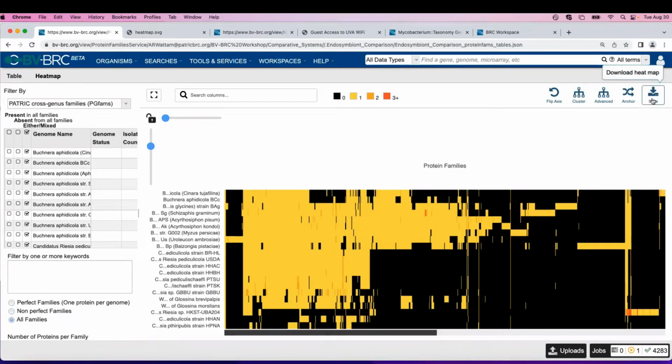But I know what you guys are thinking. You're thinking, this is just a picture. I want to see the data behind it. Is that what you were thinking? I have a different question. Okay, go ahead. I was wondering, can you also add a tree for proteins here? You can add which proteins? Like a tree for the proteins, like it's clustering. Yeah. Well, it would be nice, right? If we provided it that way.